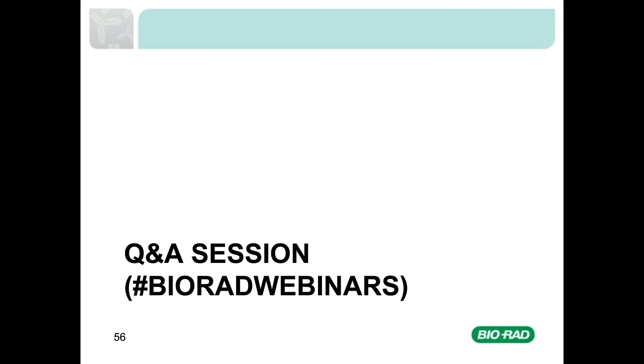The next question is, what detection system did you use in your Western blot experiments? Did you use fluorescence? All of the secondary detection reagents used to perform the Western blots shown in this webinar are in fact HRP conjugated. The blots have, however, been pseudocolored, so the chemiluminescence channel has been pseudocolored in red, and the protein standards have been pseudocolored in green.